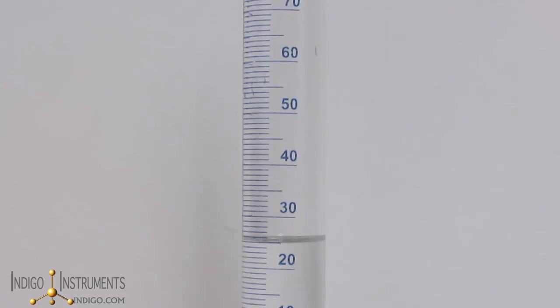In this picture, we can see that the graduated cylinder has been filled to 25 milliliters. By comparing the measurement of the grad cylinder to a weight, where we would expect 25 grams, the error is now 4%, close to a milliliter error at the 25 milliliter mark.